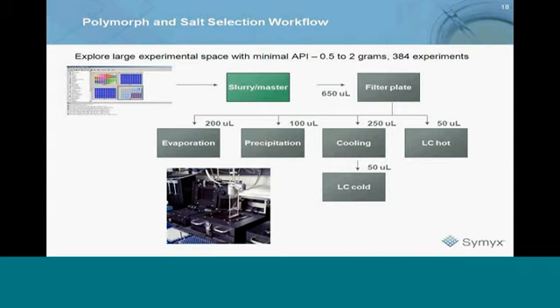half gram gets spread over 4 different plates, what we end up with is about, on average, about 1¼ milligrams per sample. So picture you've got 96 samples per plate, 384 wells, so it's about 1¼ milligrams if everything was uniformly distributed. The big reason for doing that is that X-ray analysis is really what would drive needing that. That's the type of analysis that needs the most amount of material. If you want to do X-ray analysis, you need enough material there in order to get a decent diffraction pattern off of it.